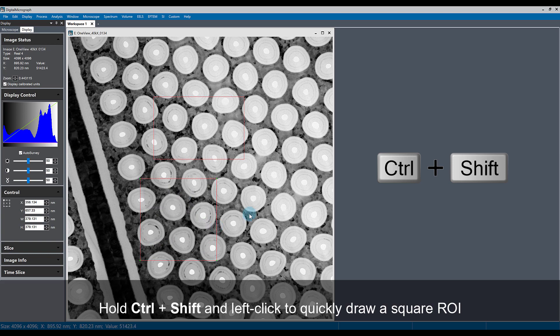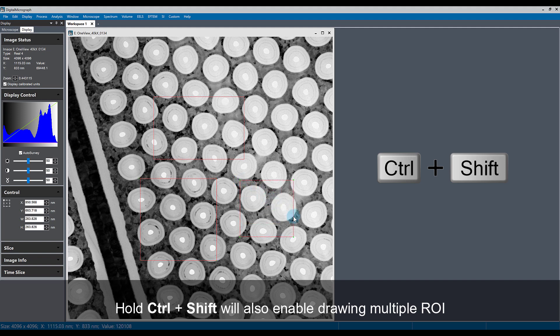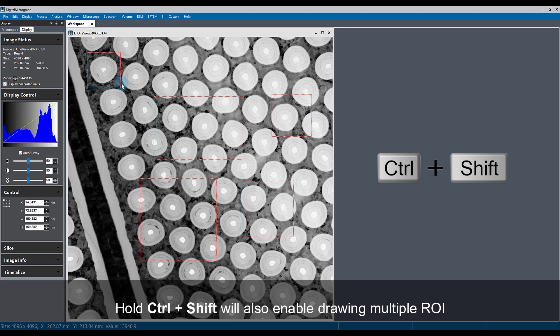The shift key also makes it so you can draw multiple ROIs on an image at the same time. So if I hold control and shift, I can left-click and drag as many times as I want to create as many ROIs on the image as I would like.